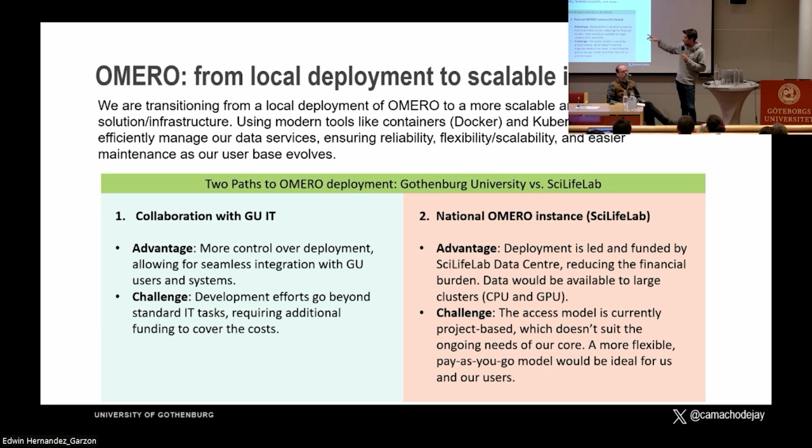I think another thing that we have to discuss, and I don't want to steal too much time, is data conversions. That's something we might have to seriously think about. What we are trying to do is that during the transfer process you can opt to have your data changed into a standard format. We don't want to enforce it, but in the future we want this to be an option on the transfer. Then we have to be very careful that we can manage the metadata correctly. That would be our commitment when you click yes. Right now we're at a stage where we can do this, especially because most of our file formats are not so diverse. For the EM, we have some challenges, but for the LM, I think we are good to go.